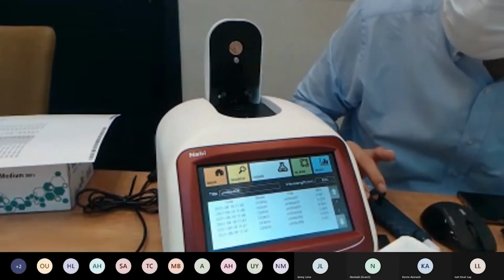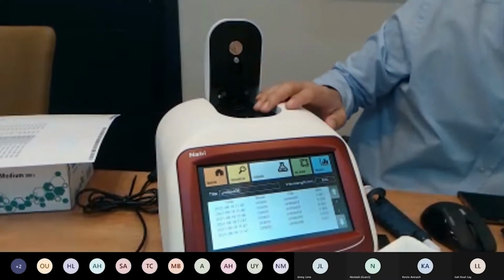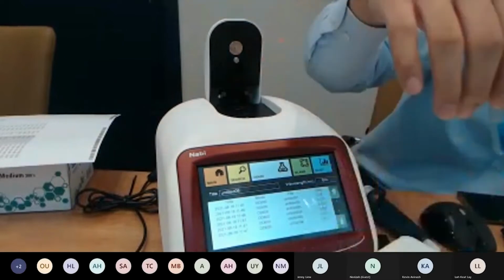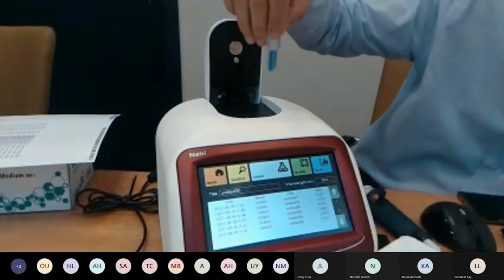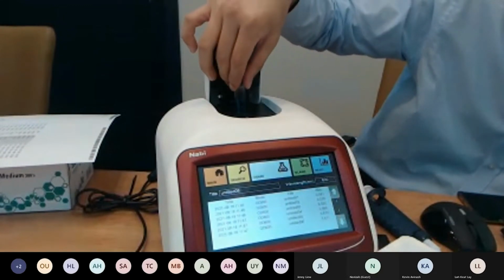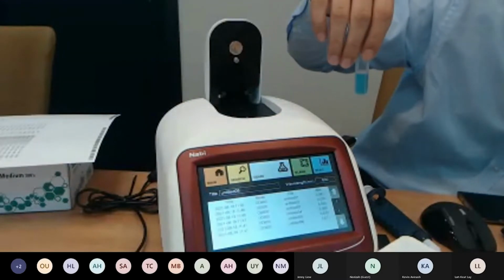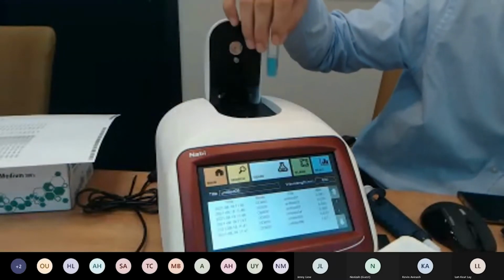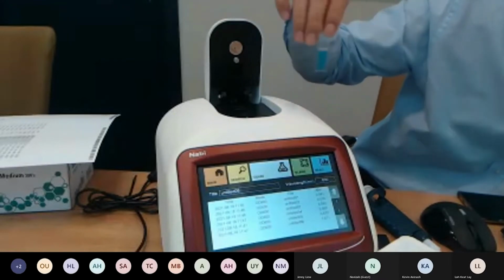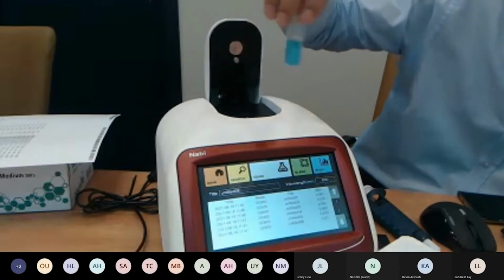I mean, these cuvette measurements are very easy. They're not difficult at all. All you have to do is make sure to put in the cuvette in the right direction. Really should not put it in a different direction. For example, if you're supposed to put it like this, but you put it in like this, then the measurements will be very weird. So if you're getting weird measurements from the cuvette, first try re-blanking, and second, make sure that the cuvette is in the right direction, with the arrows pointing the same way.